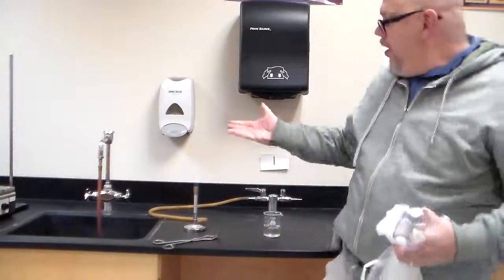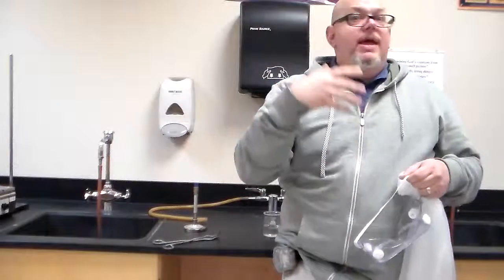Ladies, it would be kind of important to do your hair into a ponytail because, again, you are working with open flame. And while I don't have that risk of setting my hair on fire, sadly to say, for some of you ladies, yeah, you do. So it's important that you bring a rubber band or whatever it is that you're going to tie up your hair.